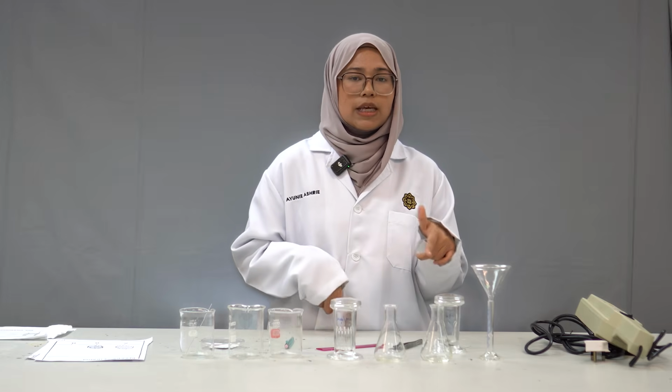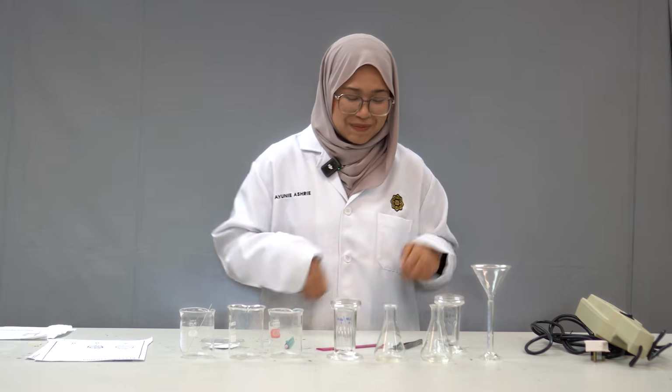In the medicine industry, TLC is used to check the purity of the samples and to check if there are any impurities formed in the products.